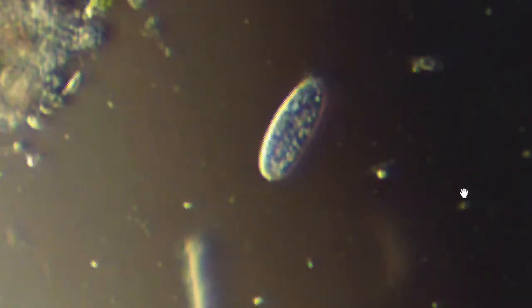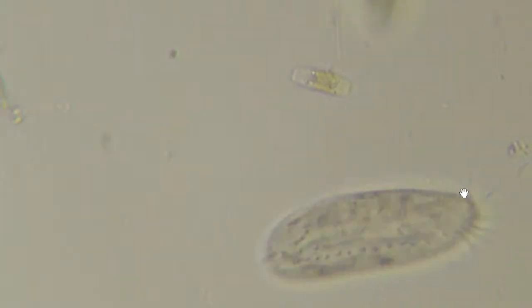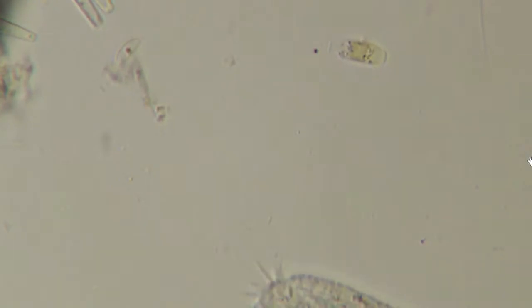Now that it's stable, let me go back a bit and try another objective. It's worth the risk. There it is. So see the spikes? Like the other one, but it's a longer body plan and it's a bigger cell. Otherwise it looks kind of like the other one. It doesn't have those striations like the other one did. But I like these guys a lot. Usually, this one's nicely slow, going in circles, but usually they're quite active. You gotta chase them around.